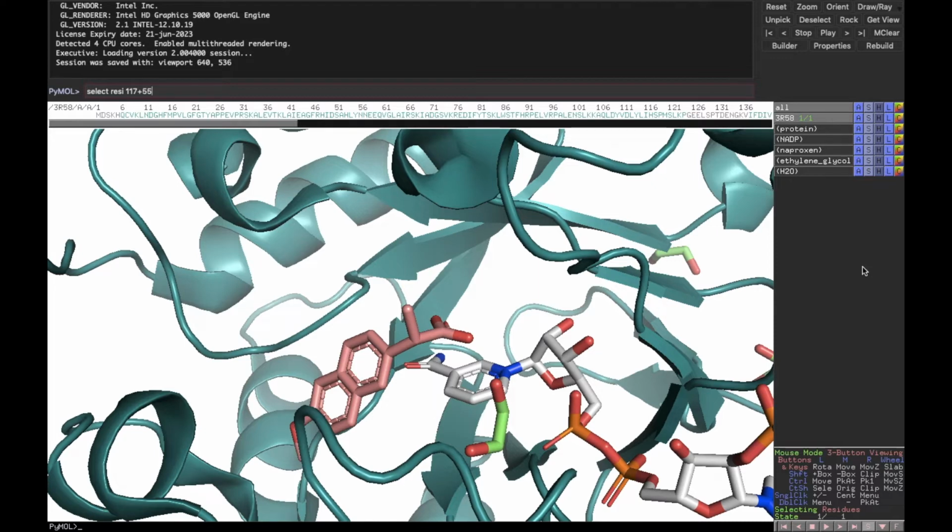However, it's sometimes easier, just while you're typing it in, to name this selection, because if you had something here that was already a default selection named SELE, this selection would override that and completely delete all of your work.